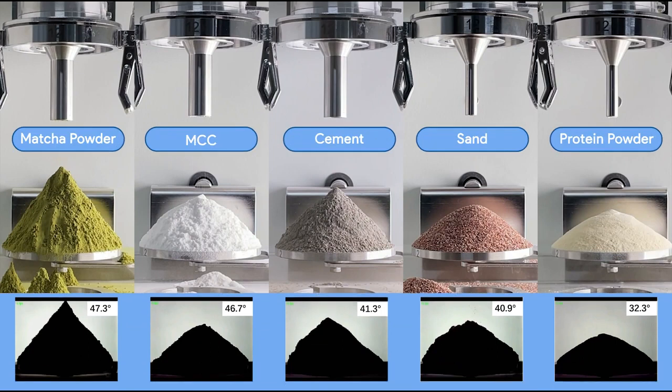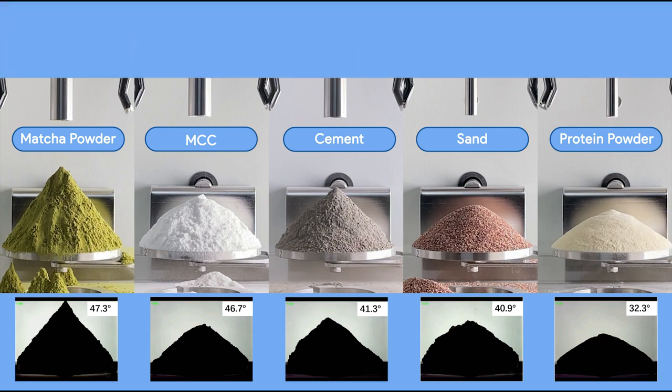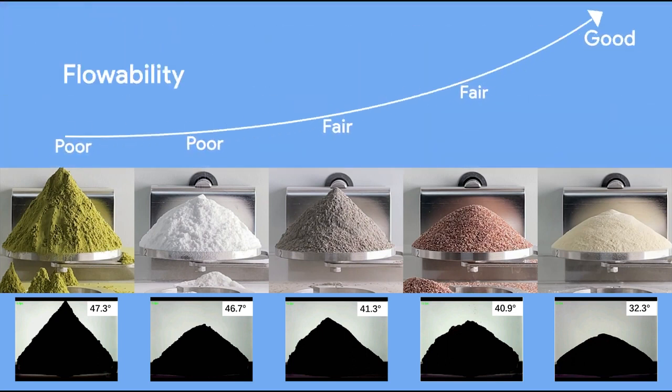From this experiment, we can see that angle of repose has an inverse relationship with the flowability of its granular material. Normally, the lower the angle of repose is, the better the powder flowability is.